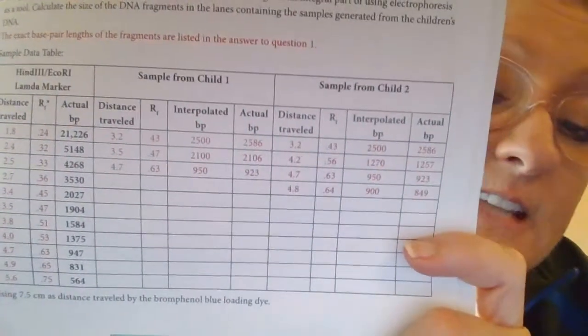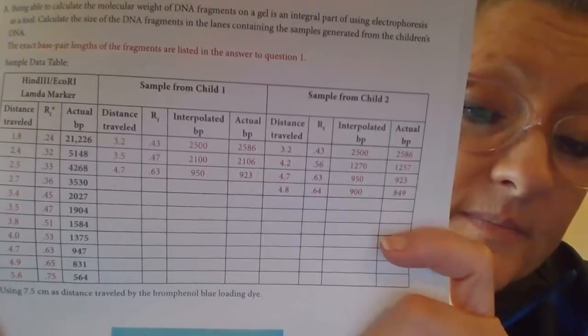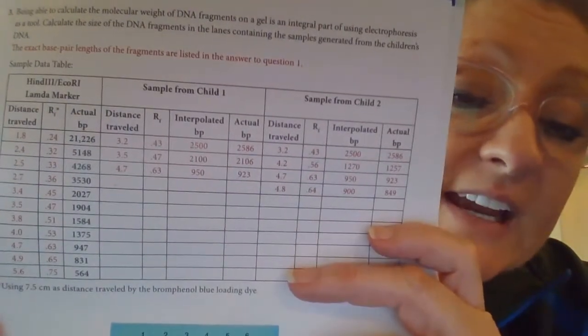We had to measure the distance traveled for child number 2, which is in well 4, and child number 1, which is in well 5. And then there are the distances that we determined. You can see the distance traveled. We calculated our RF for each one. And then how did we get this interpolated base pair? For child number 1, I have the distance traveled and I've got my RF factor right there. Then the RF factor had to be interpolated to get my base pair length.